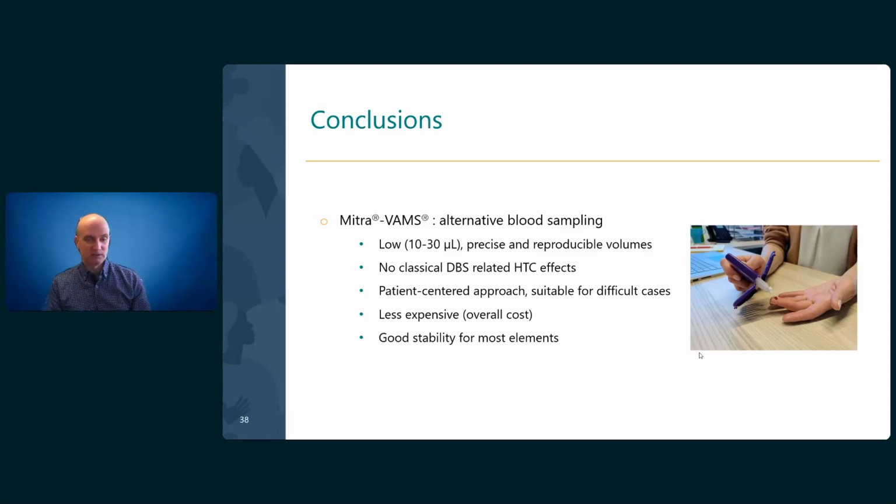There are no effects related to hematocrit, as is the case for DBS. It's a very patient-oriented approach, really a patient-centered approach, and it applies to difficult cases.